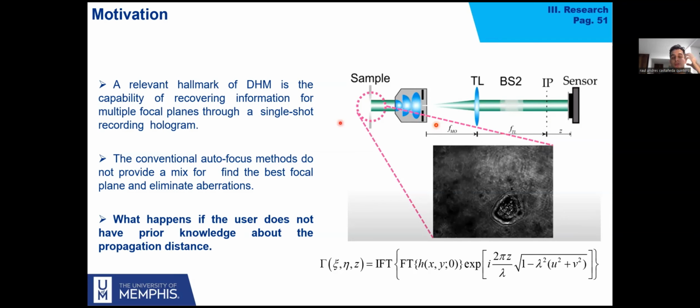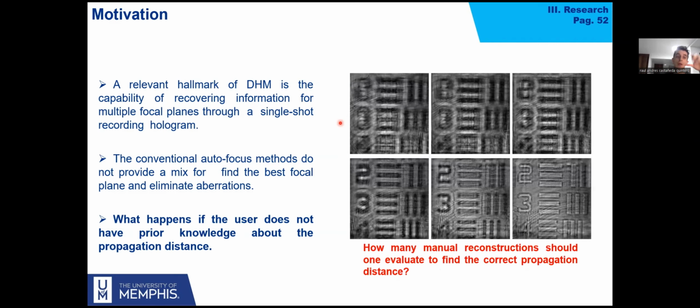The motivation is to try to create an algorithm that can obtain in-focus, aberration-free reconstruction for holograms that have been recorded out of focus, right?